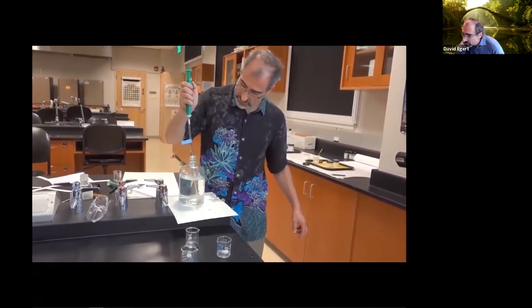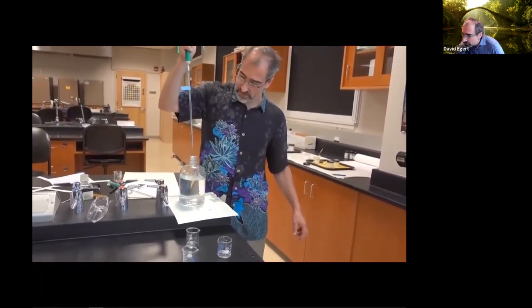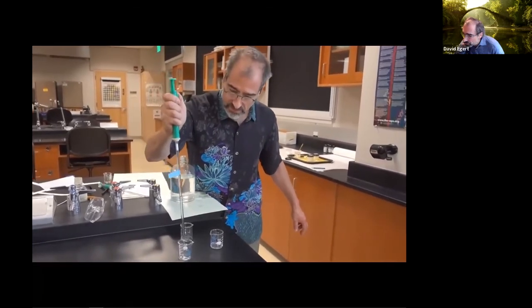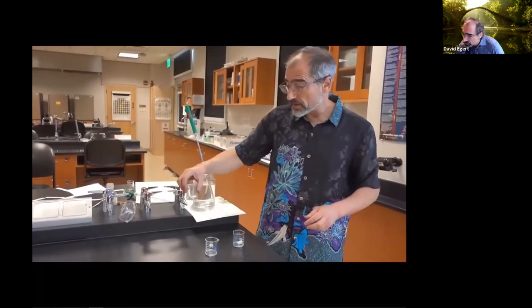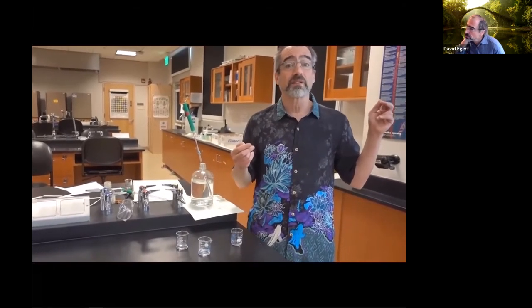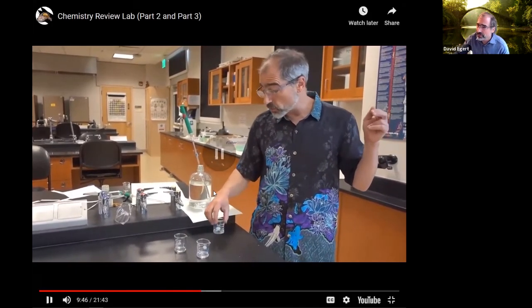Suck up to the 0. So here we've got all of our electrolytes. And again, electrolytes, you should know what it means to be an electrolyte. So what do I mean by an electrolyte?